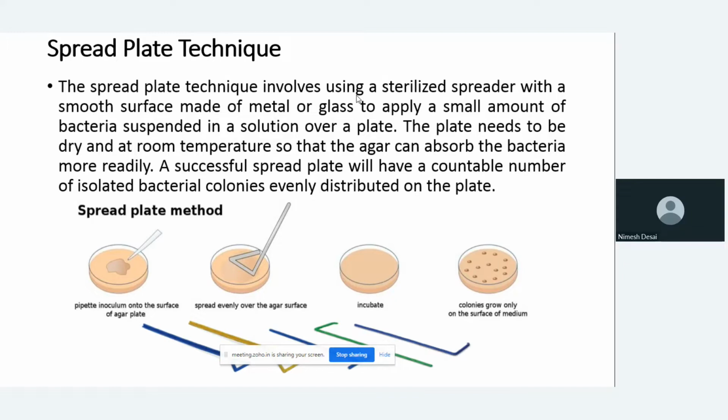In the current scenario, to reduce the time and achieve the highest productivity in the market, many scopes are open. Right now, instead of glass Petri plates, plastic Petri plates are available in the markets. Also, instead of a glass spreader, we can utilize a plastic spreader, which is pre-sterilized and gamma radiated.